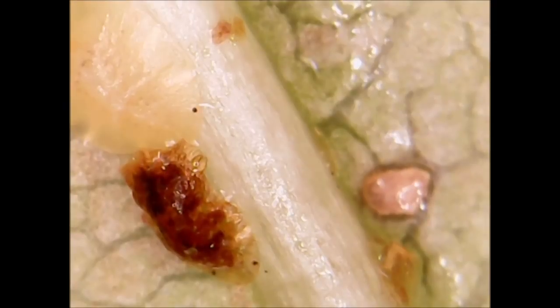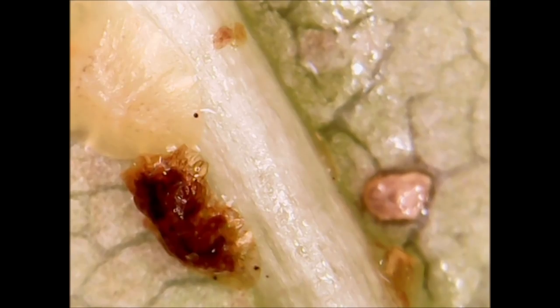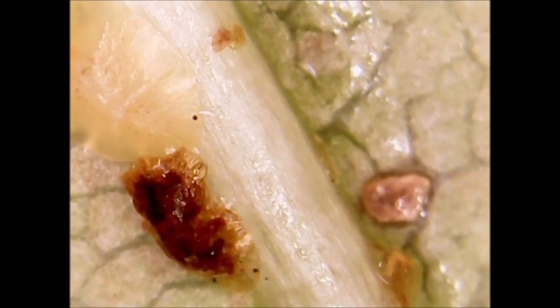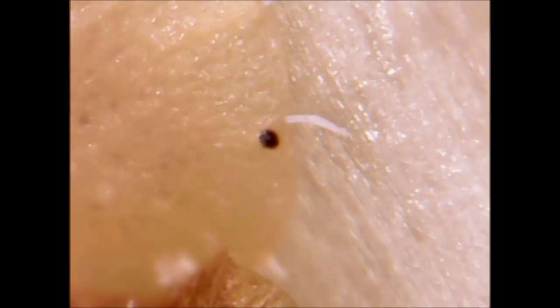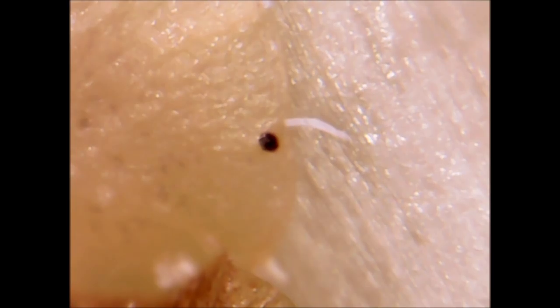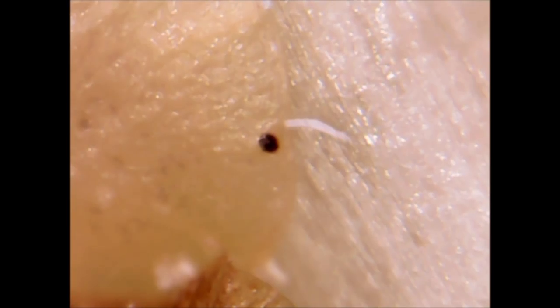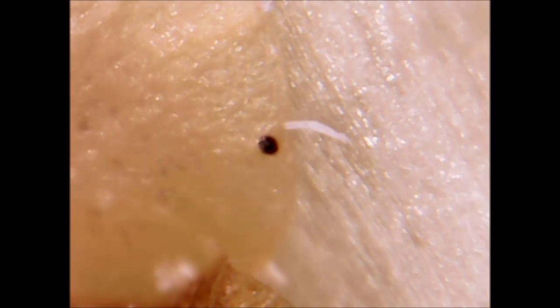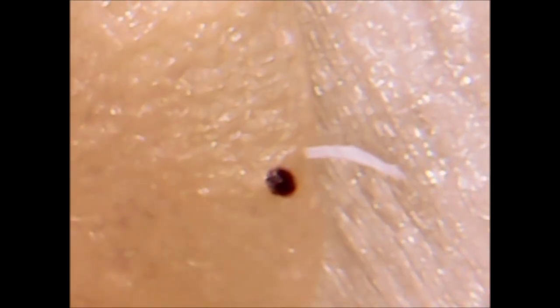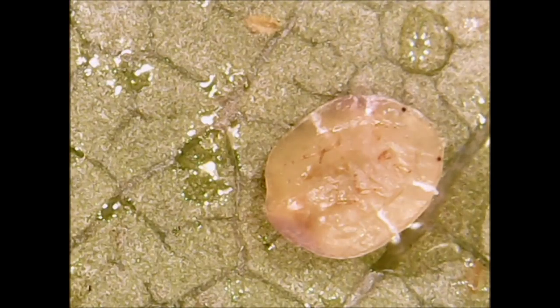I can't even tell if it's a baby scale or what, but it's frantic. Another shot of the scale — you can see its eyeball clearly and the dead scale from past treatments. I was amazed to be able to see the eyeball, and there's something that looks like a tusk coming out — that's obviously whiskers. There's a better shot of it; maybe it's an arm or a leg. Looking at it now, it's probably a leg stuck in position holding on. I flipped the scale over — this is the exact one we were looking at.